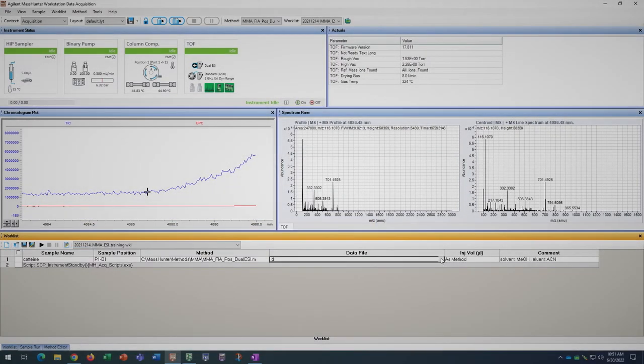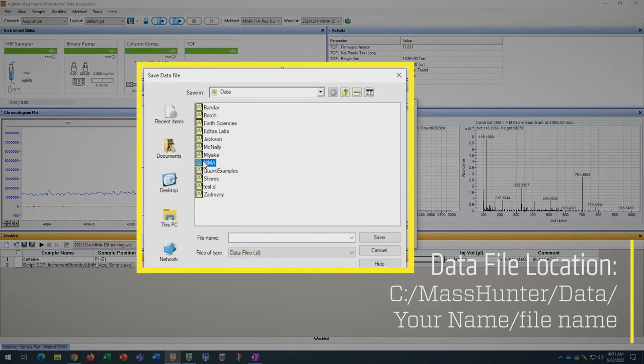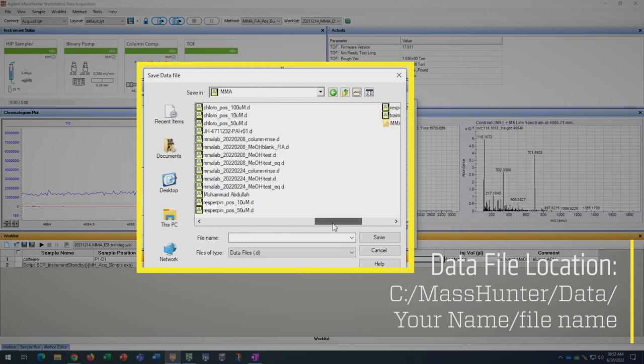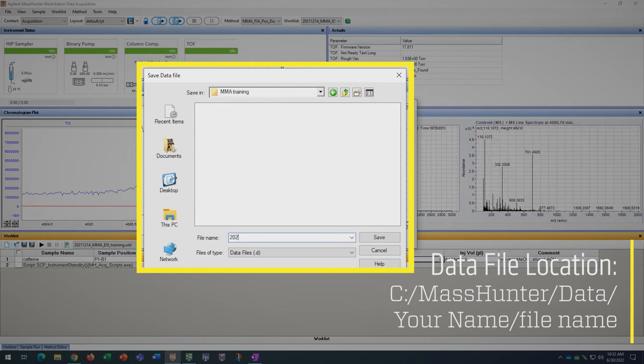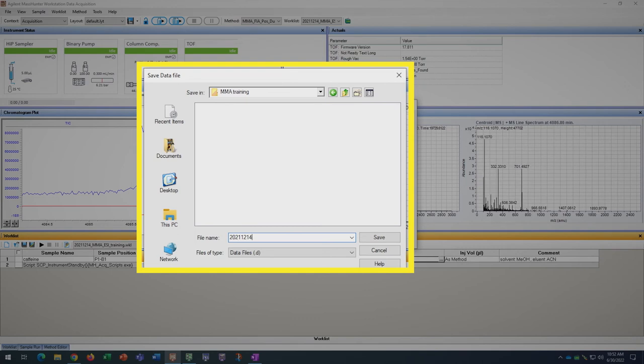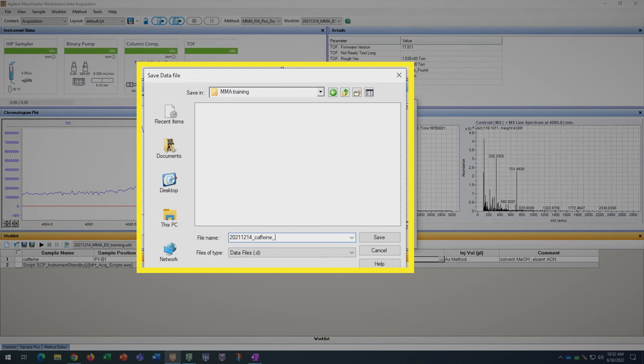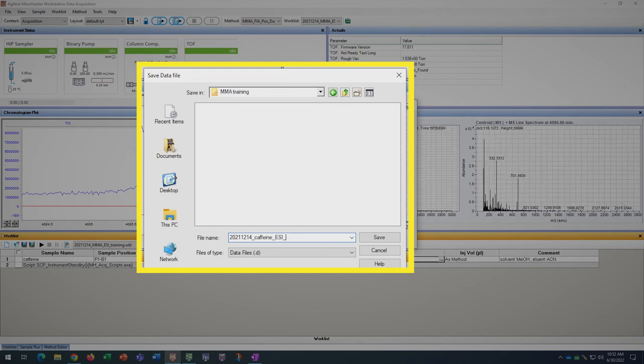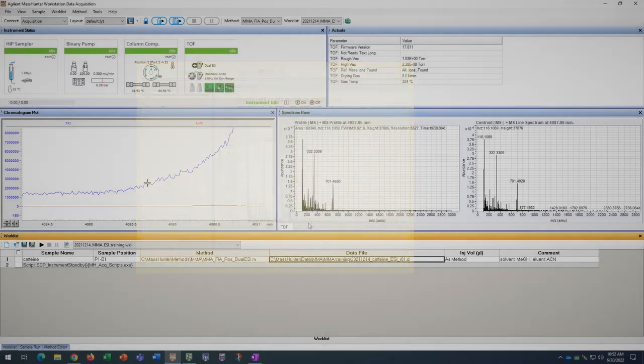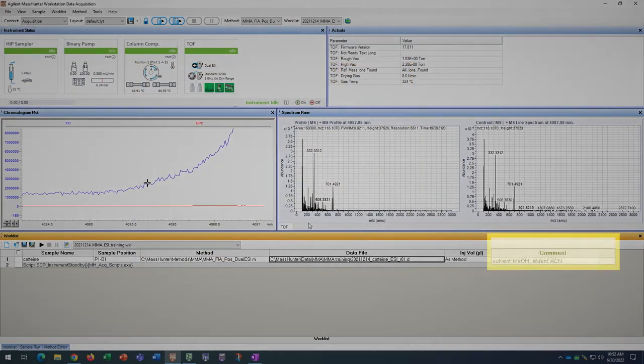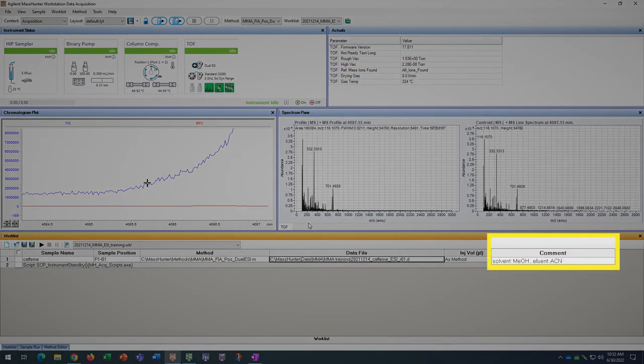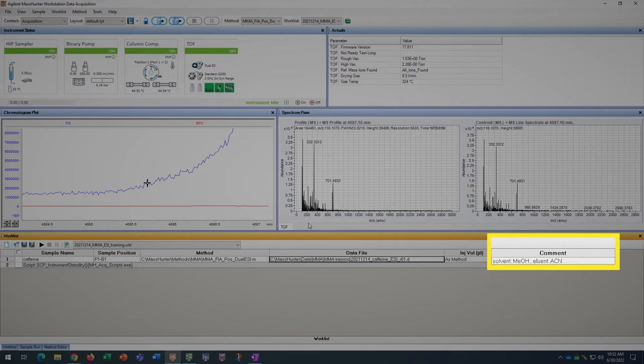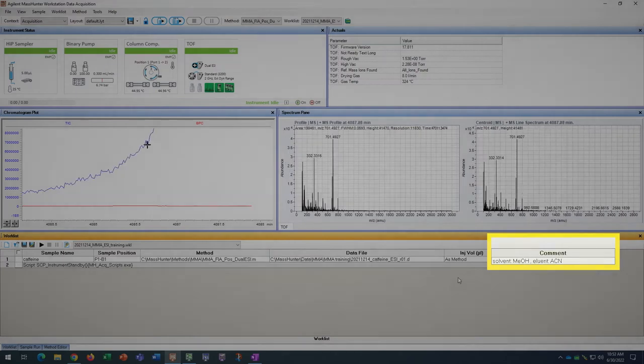Next, specify your data directory and file name. It is good to keep track of your sample runs by specifying a run number each time. This prevents overwriting of experimental data by the software. The comments section is helpful to specify solvents, elements, and additives for record keeping and troubleshooting should your samples not ionize properly.